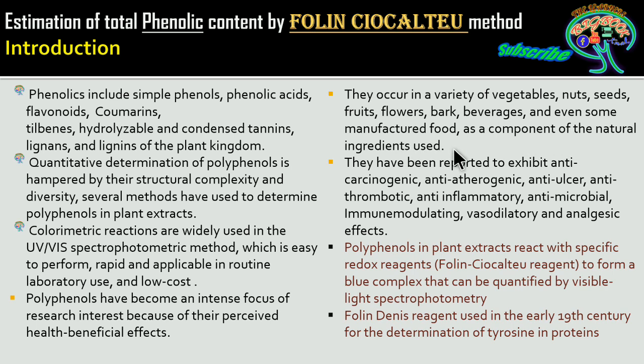Now, if you consider the whole plant as the product, whether the flower, fruit, bark or shoot, you take any part of the plant, there will be the presence of phenolic content.